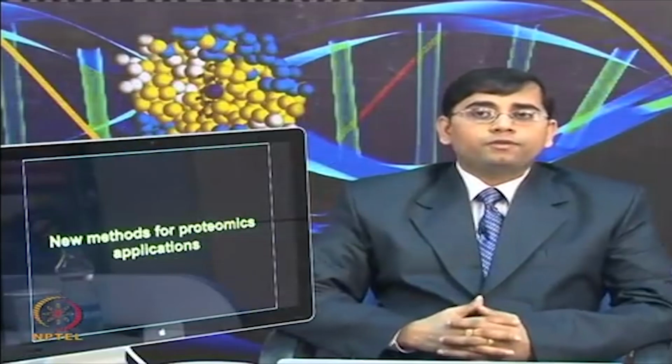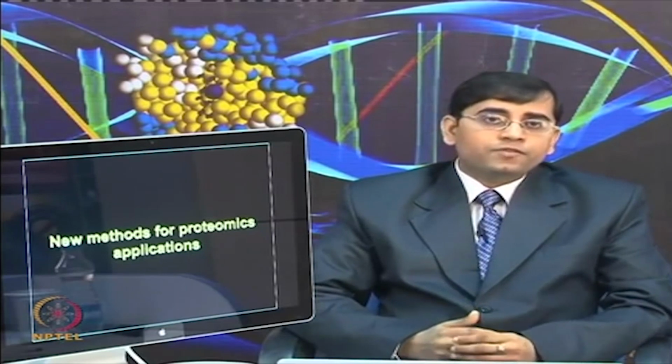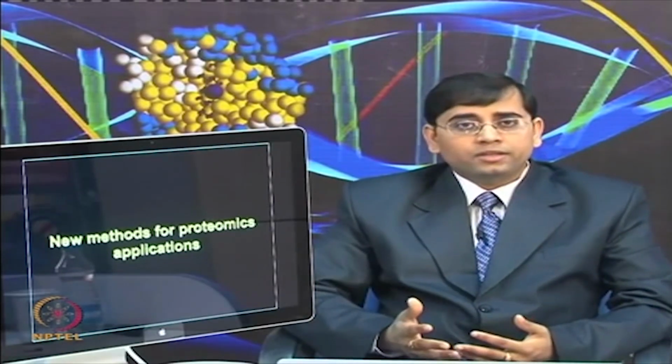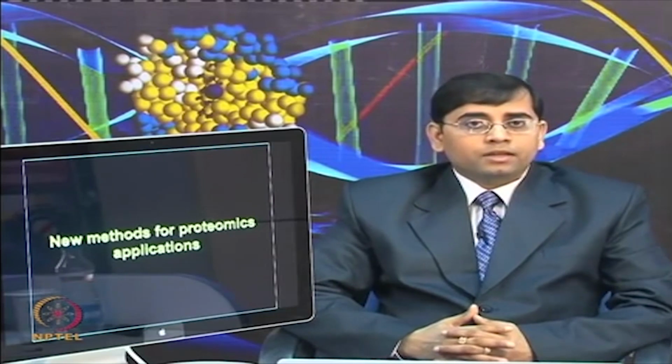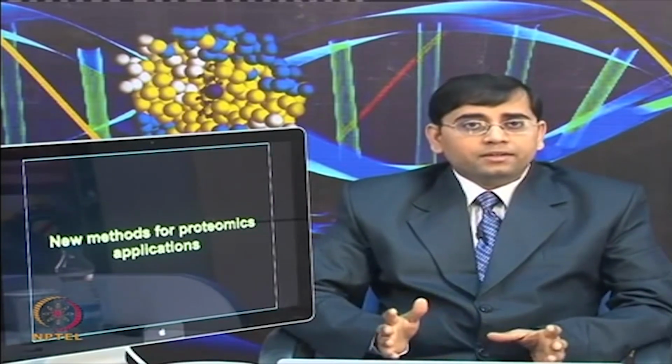So, now I have described the workflow of performing two-dimensional gel electrophoresis, and in this workflow today we have talked about staining methods as well as how to scan and analyze those images using various software. After that, you have completed the workflow of two-dimensional electrophoresis.